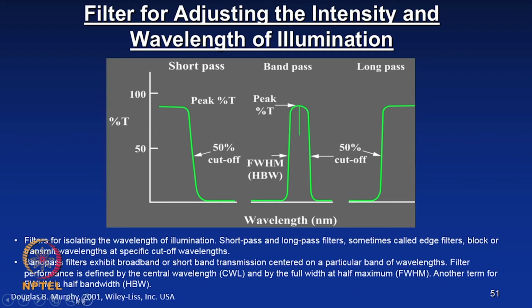This filter performance is defined by the central wavelength and by the full width at half maximum. This is the full width at half maximum.